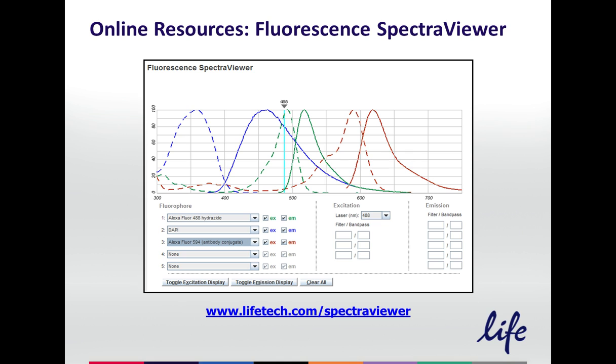Now remember, when I say filters, I'm talking about a little filter cube, usually that goes in your microscope. It has 3 pieces of glass in it. One is the excitation filter, one is the dichroic mirror, like a two-way mirror, and then the third is an emission filter. And using these combinations, you're able to select only a particular dye so that you can get rid of all the extraneous background from other dyes or your light source and get a nice crisp image with good signal to background. And you have one filter for each dye, optimally.